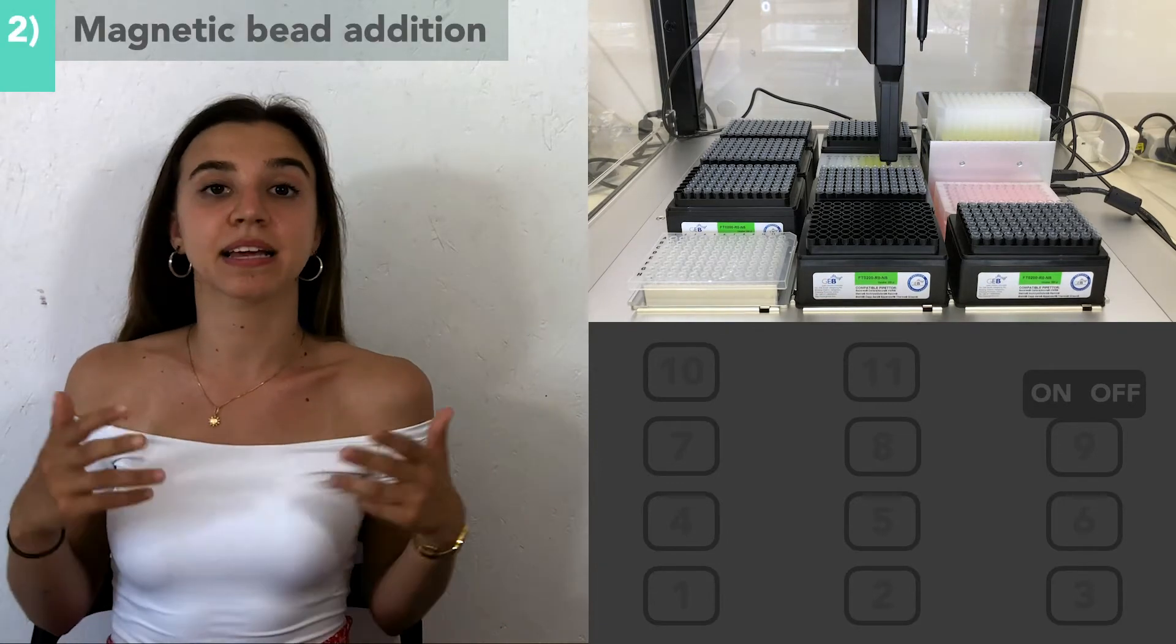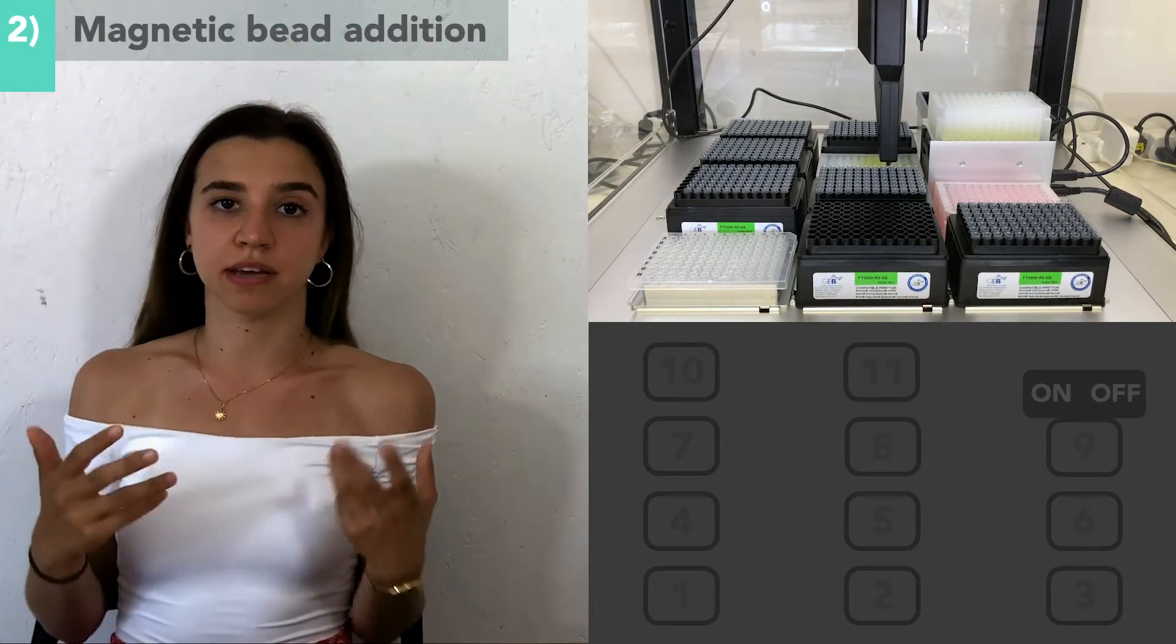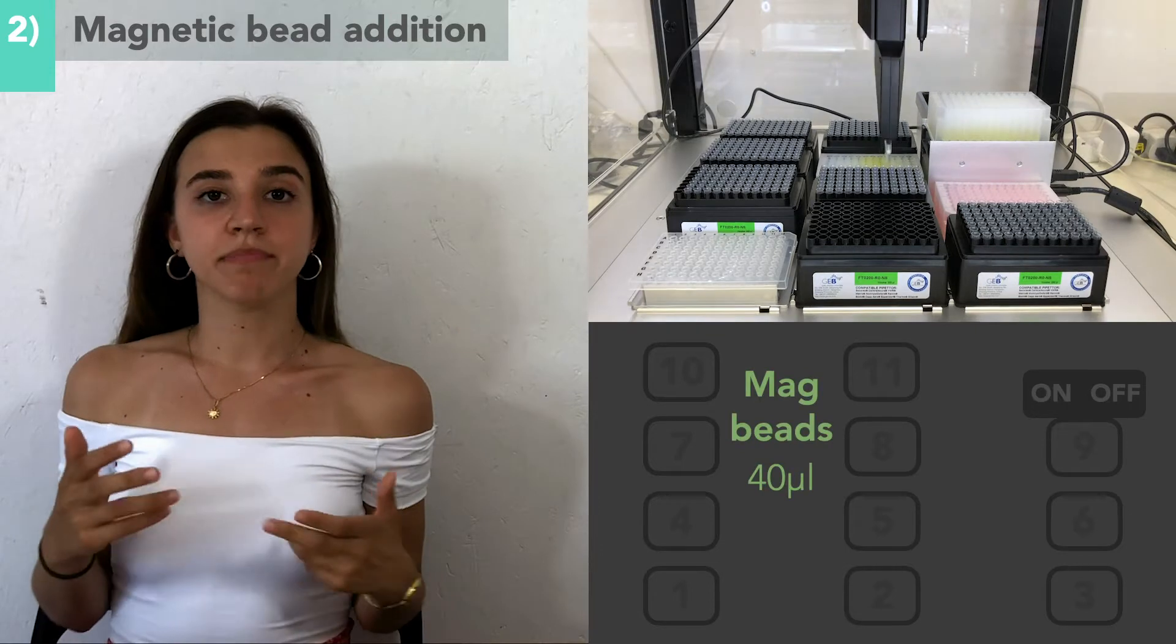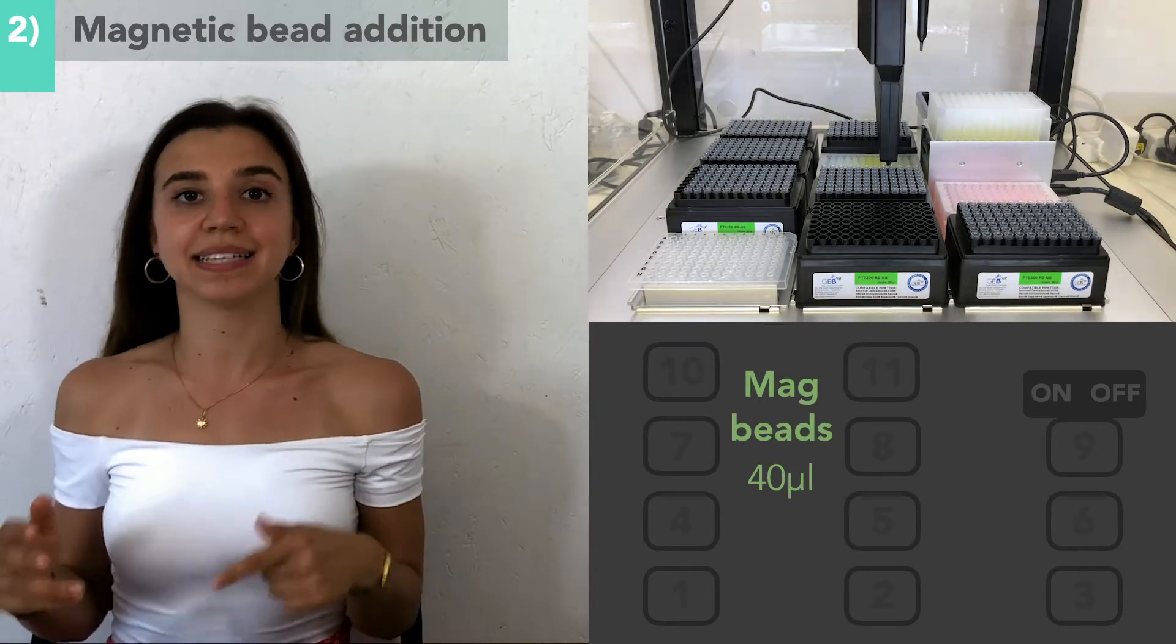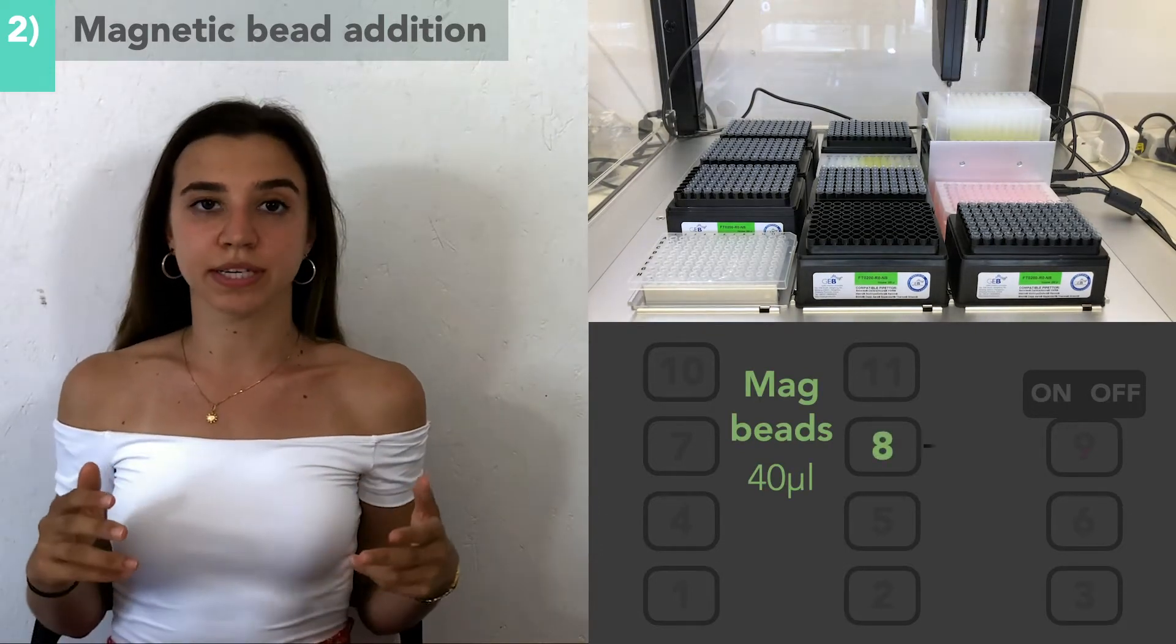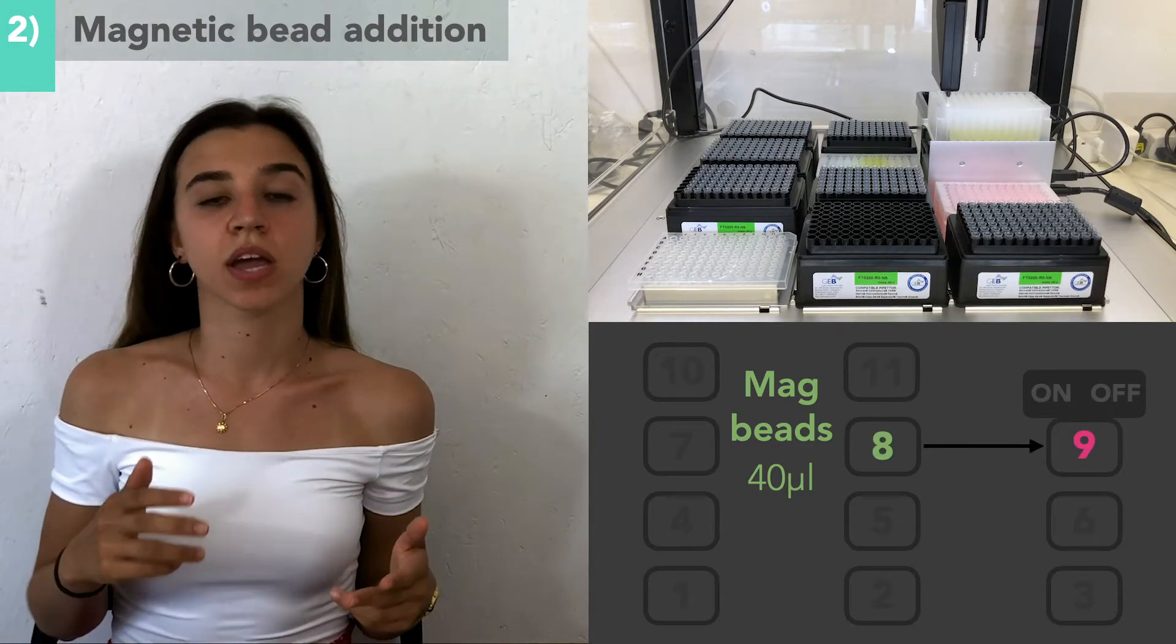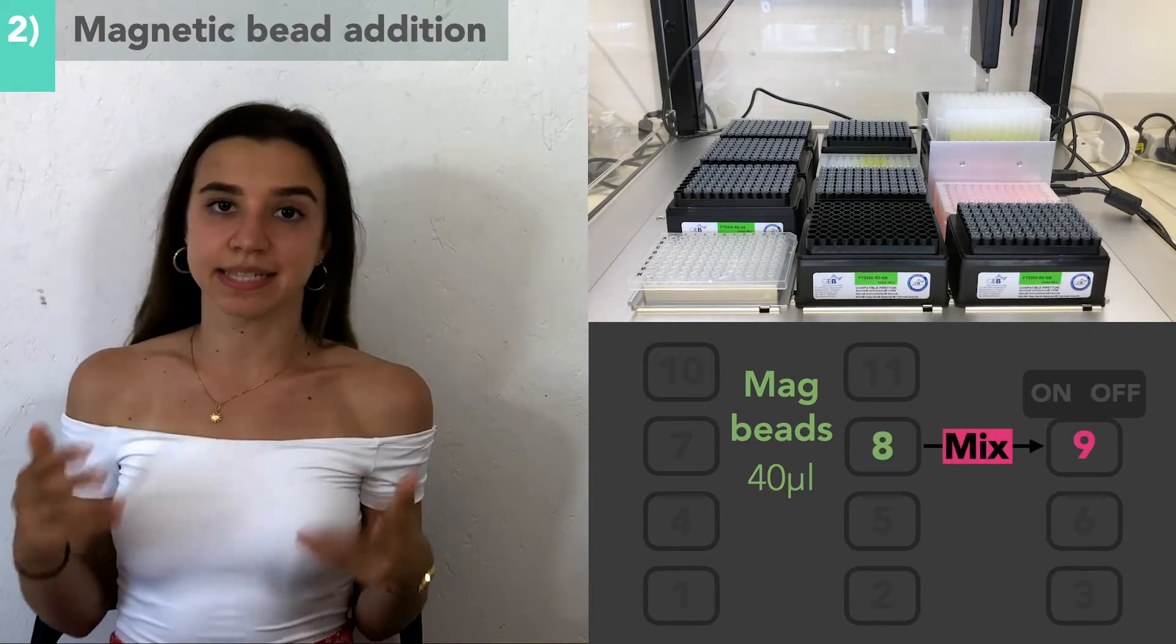After all the sample wells have been mixed with isopropanol, the silica-coated magnetic beads will now be added to the sample plate. 40 microliters of magnetic beads from column 9 in slot 8 will be deposited to each sample well. Once again, this is mixed by pipetting up and down.